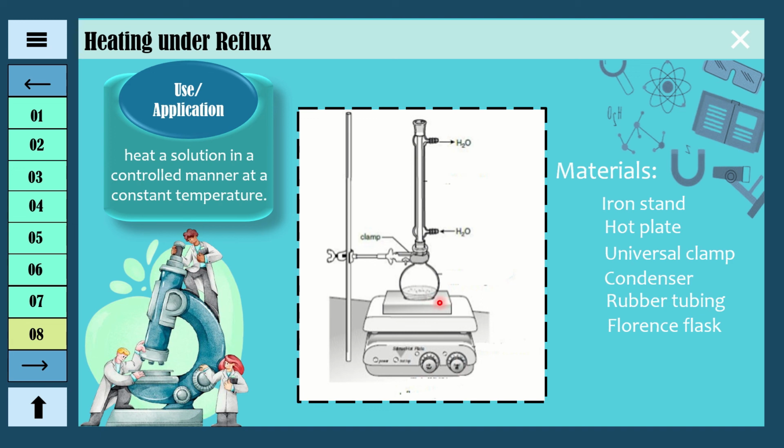Then, you lower the temperature to the minimum value that will sustain the boiling process, keeping the temperature constant. Once the temperature is lowered down again below the boiling point of the solvent, you increase the temperature again. The main goal here is to keep the boiling point temperature of the solvent constant, so you will just increase and decrease the heat source to maintain it.